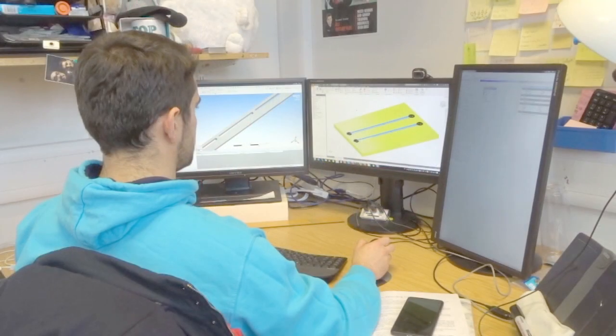So currently, microfluidics is used widely in designing diagnostic devices for infectious diseases, handheld diagnostic devices, drug delivery devices, and analytical devices for research purposes such as analyzing very small volumes of blood and cell counting.